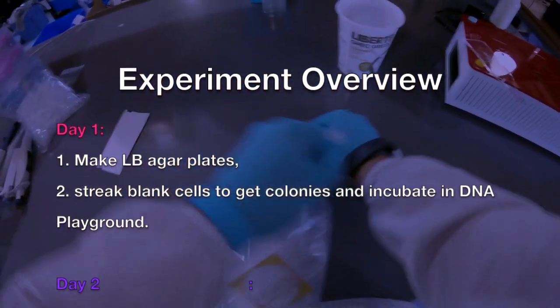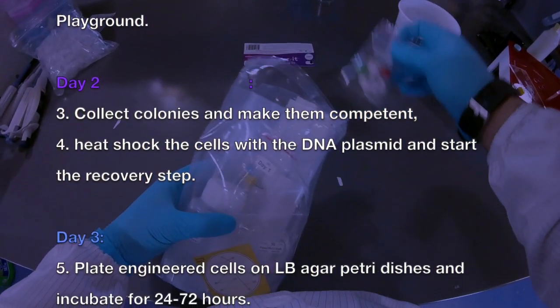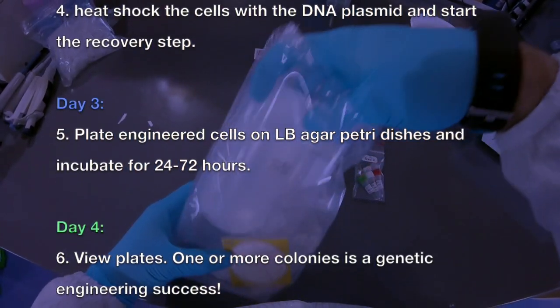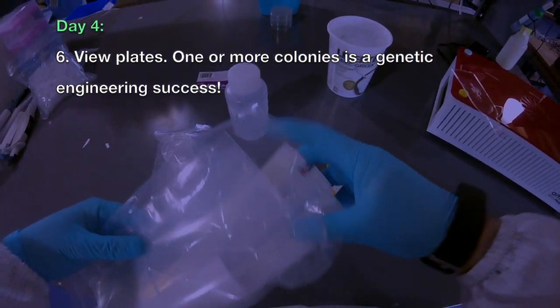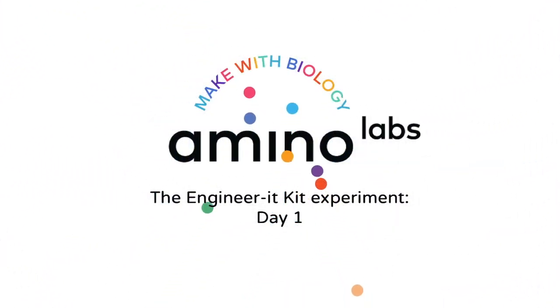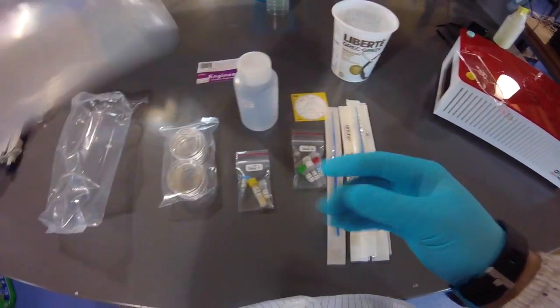So these are well sealed. Sometimes they're a little hard to open. I'll pull out all the components here. Okay, I'm going to keep the bag because we're going to put some stuff back in there. So we'll start with this.